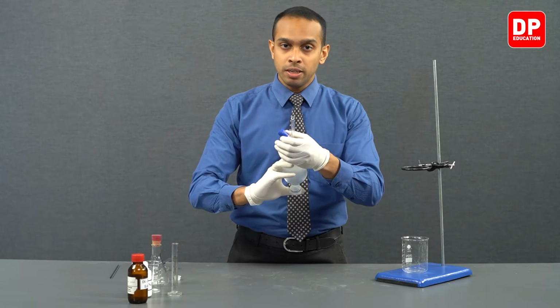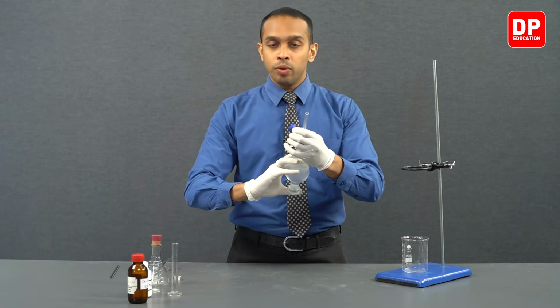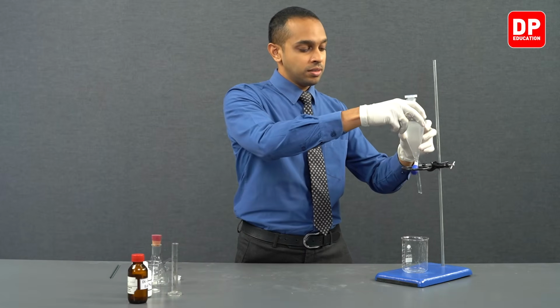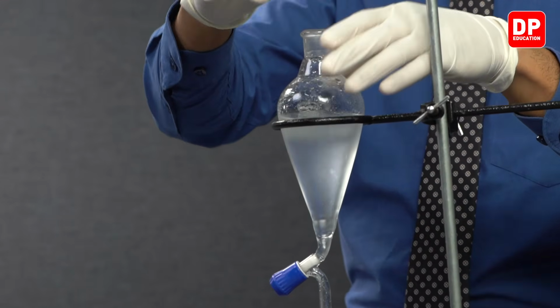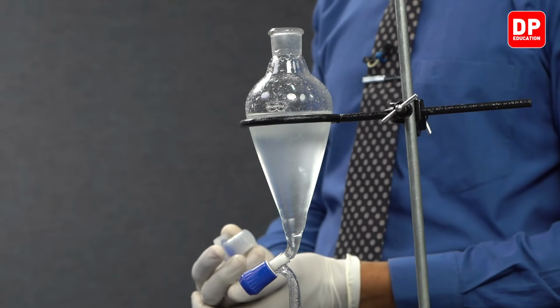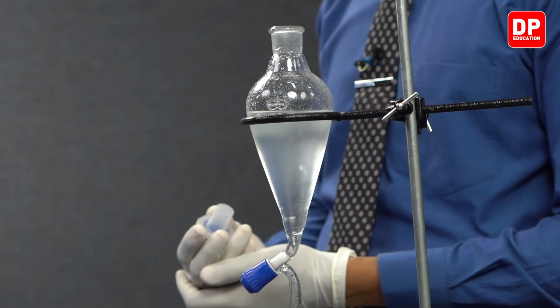After mixing the mixture quite well a couple of times like this, we can then place this separating funnel in the stand, and we can allow the mixture to separate into two layers within a matter of few minutes.